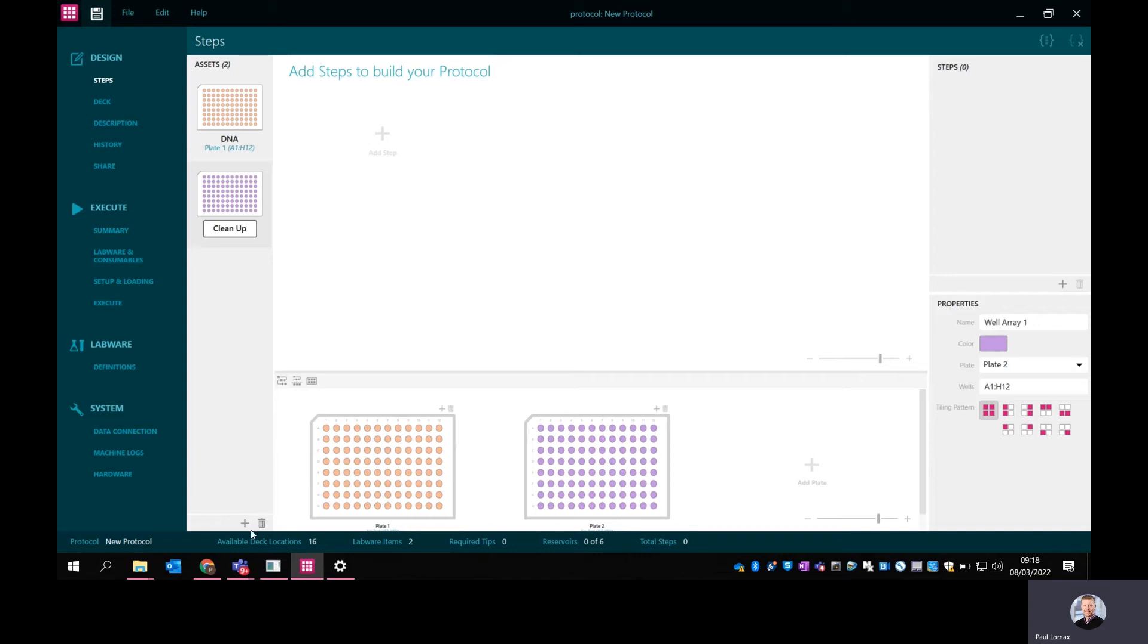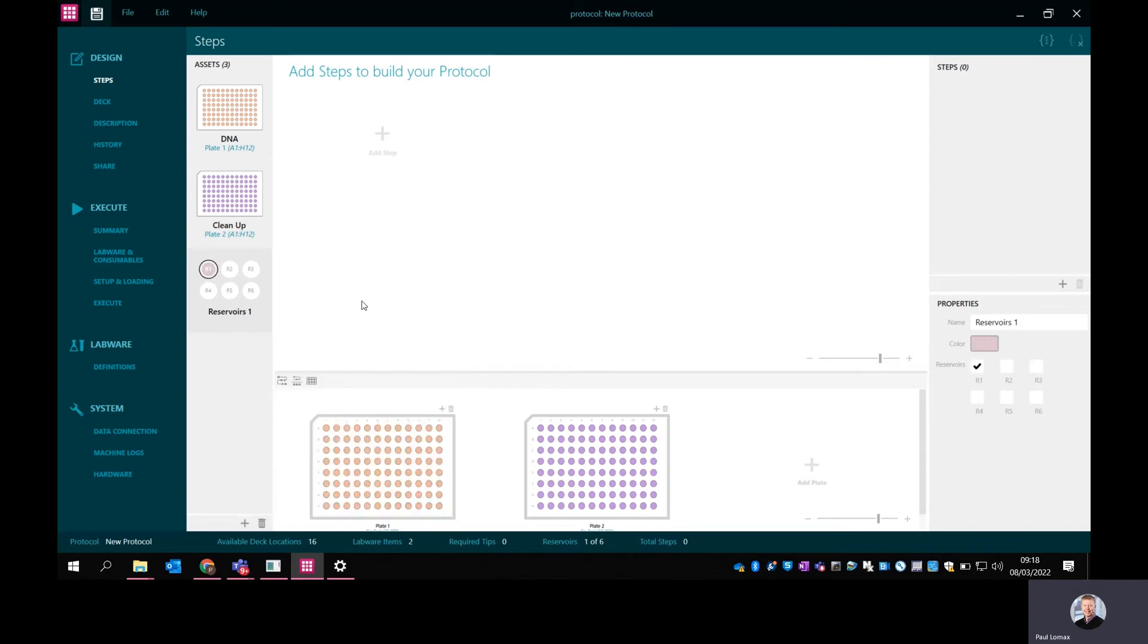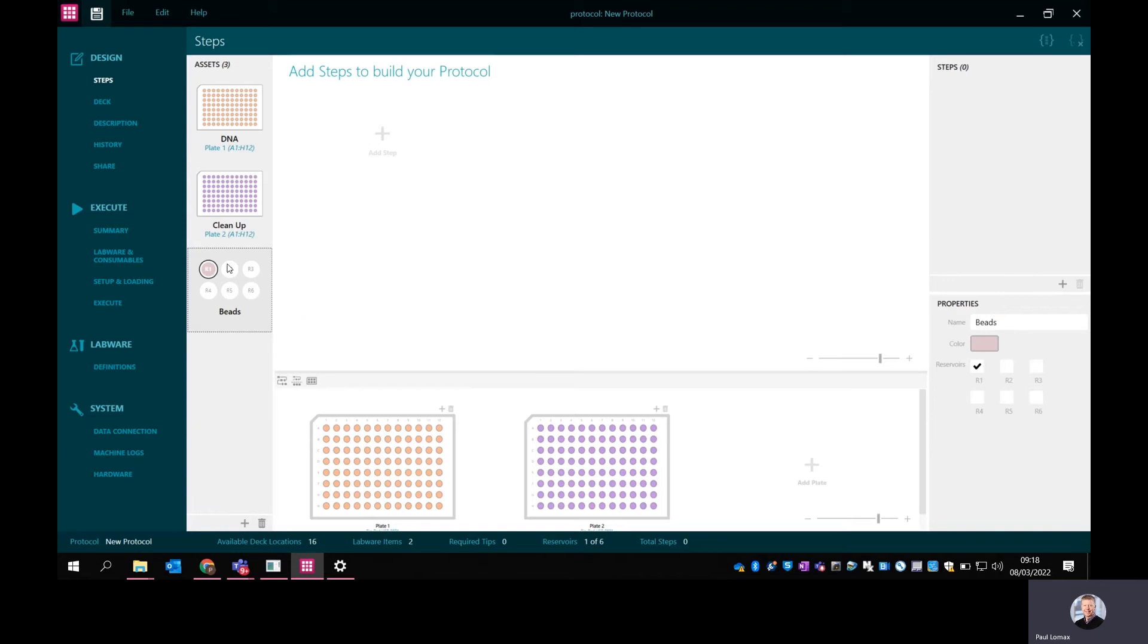I also want to use the dispenser on the system, so I'm going to add some reservoirs. I'm going to select just one of the syringes to dispense some beads. You can use up to six syringes, but it will go faster if it's dispensing with syringes simultaneously. In this case, I just want to use a single syringe to keep the dead volumes down. You can have different reagents in different syringes - any combination you want.